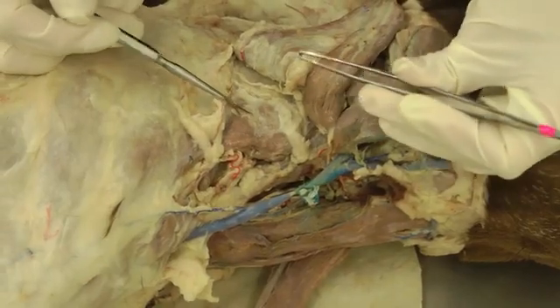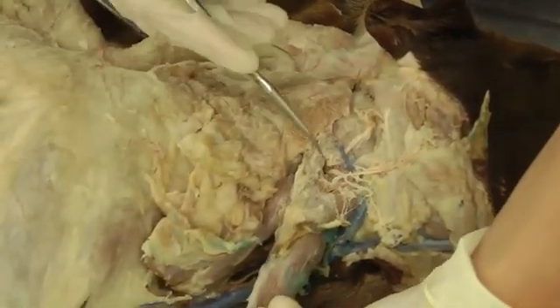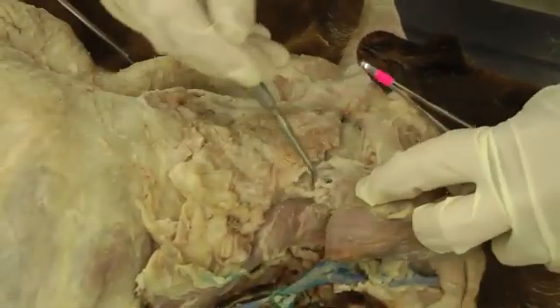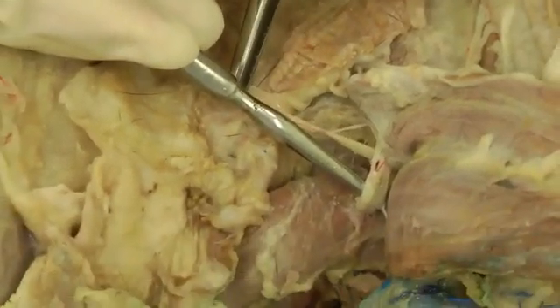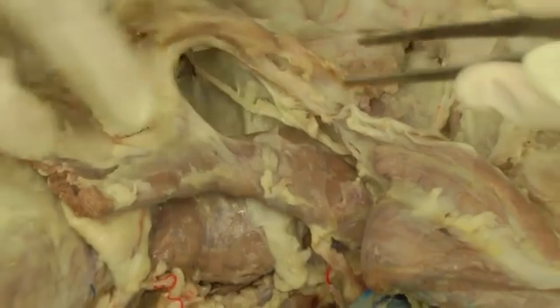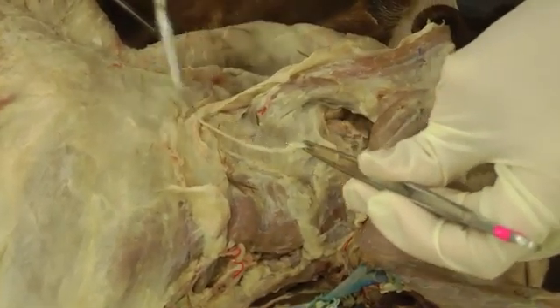Then we have the accessory or 11th cranial nerve that we need to find. After you reflect those muscles it should be a little bit easier. If you see another nerve in the same field going in that direction, that's the accessory nerve — not the great auricular. You can see it's going right by where C2 is coming out. Try to trace it a little ways because it's going to go back towards the trapezius muscle — that's the accessory or 11th cranial nerve.